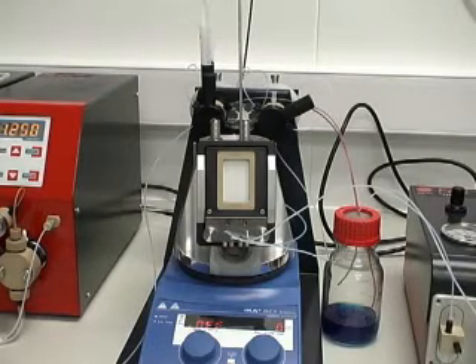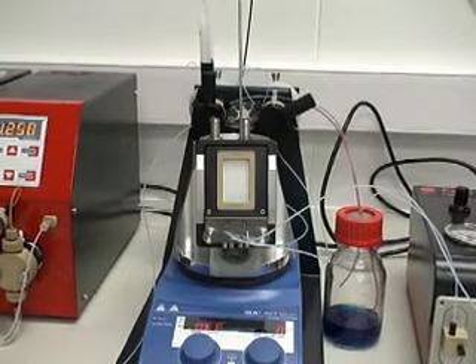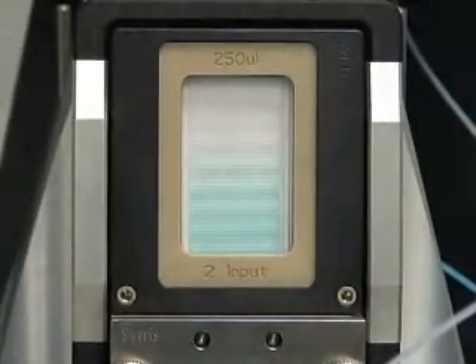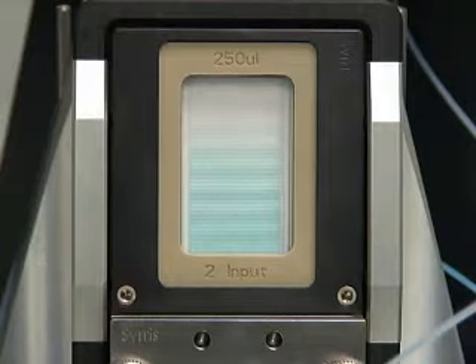In this demonstration we're using an aqueous blue dye and ethyl acetate to simulate an aqueous workup. We're using a microreactor to show the mixing of the two materials, although this can normally be performed internally to the FLEX.